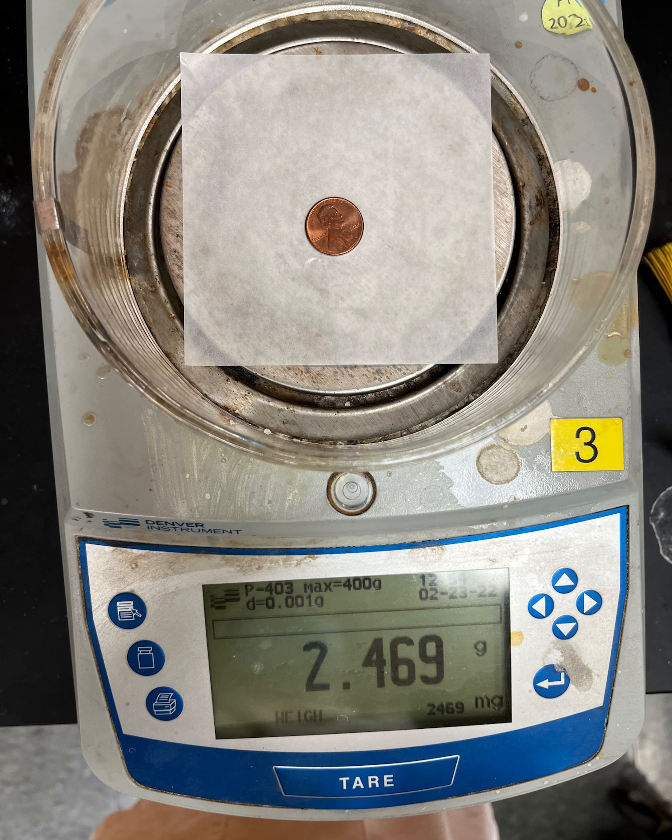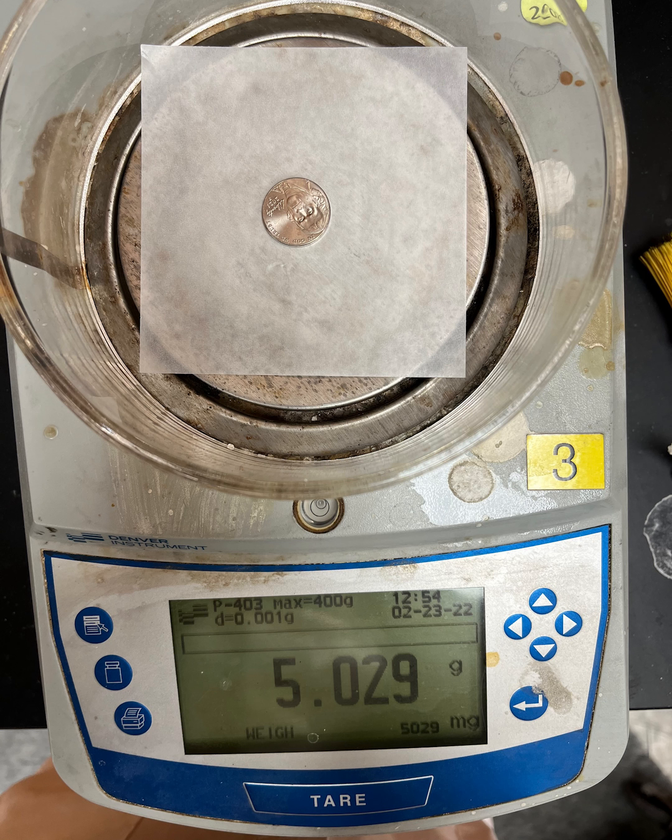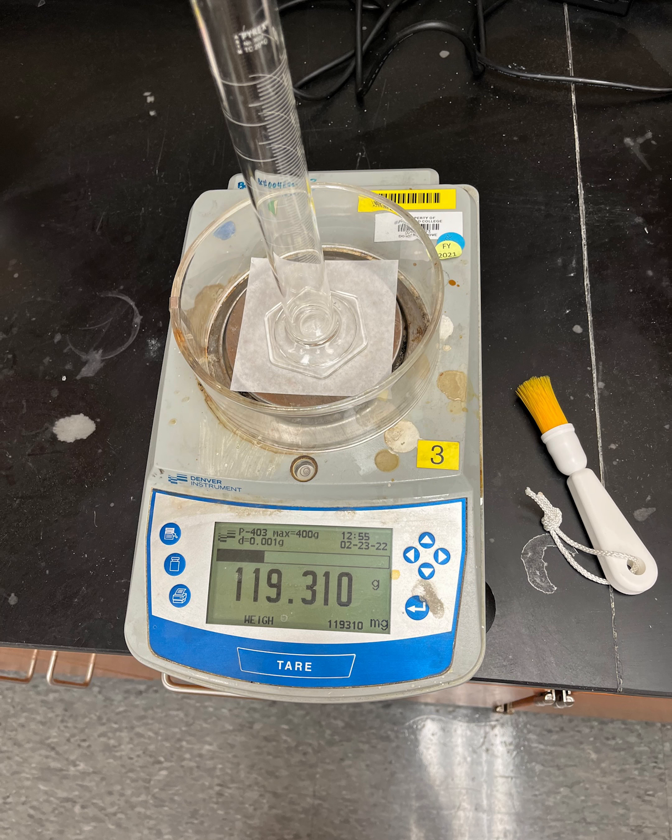The first object you are measuring has a mass of 10. Please record the mass on the data sheet. The second object is the 150 milliliter beaker. Then you measure the mass of a nickel — record that number. Now measure the mass of the empty 100 milliliter graduated cylinder.